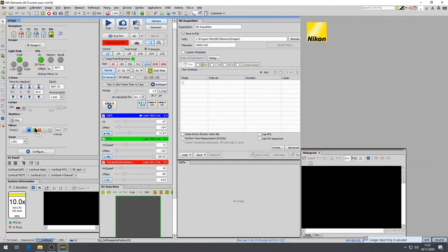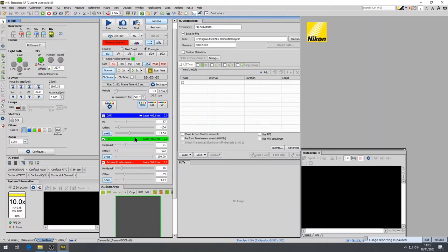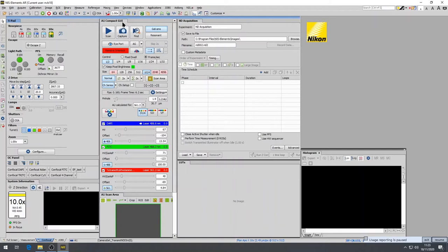It is necessary to re-enter the confocal mode in order to observe your samples through Nikon Elements. First deselect eye port and then select the channels you wish to use. Automatically you find the channels which were used last in the lower part of the A1 compact GUI box. To reset the confocal settings appropriate for the sample in hand, press this button.